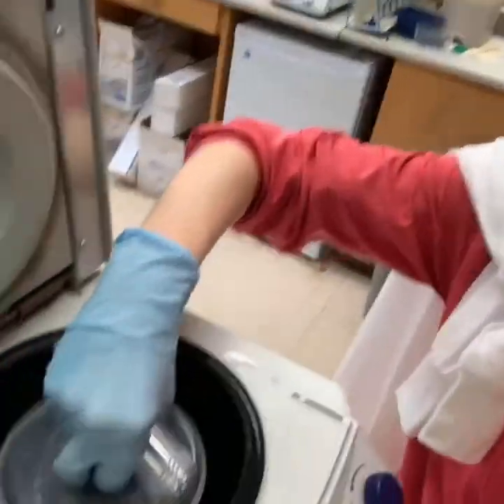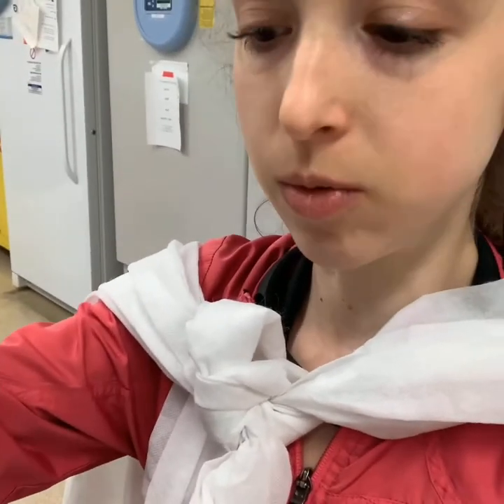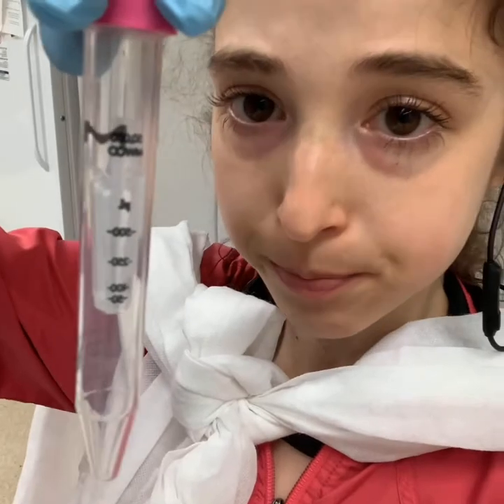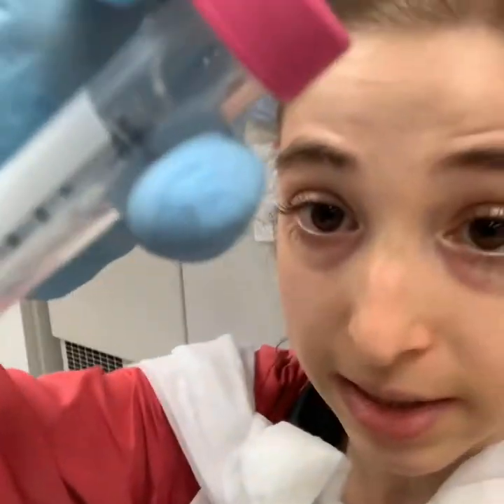With a fixed angle centrifuge, the rotor where you put your tubes in is at a stuck angle. With any concentrator, you want to look at the instruction manual because they differ. With the swinging bucket, you can add more volume typically — this size will fit four milliliters with swinging, but only 3.5 if you're using fixed angle. With fixed angle, make sure the membrane side is up. Fixed angle can go faster so you can get shorter times. We use the swinging bucket usually.